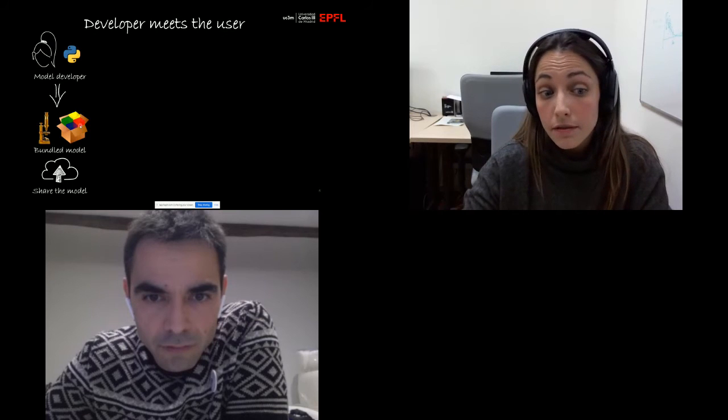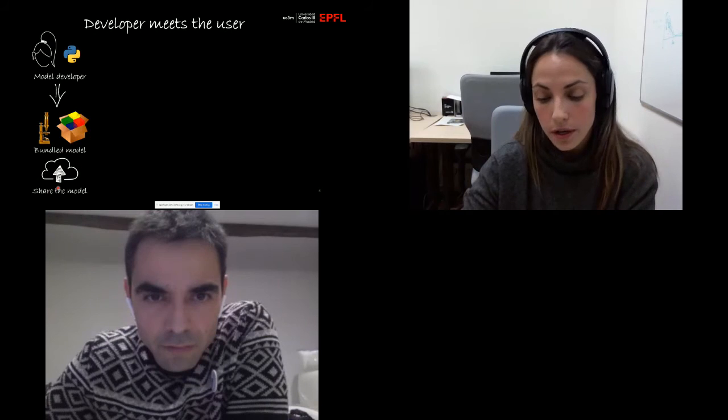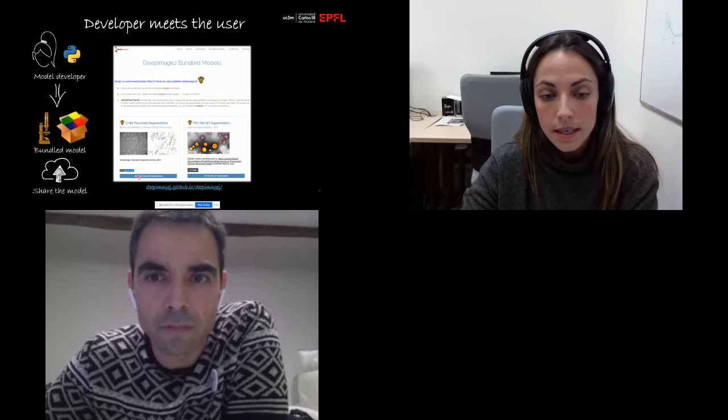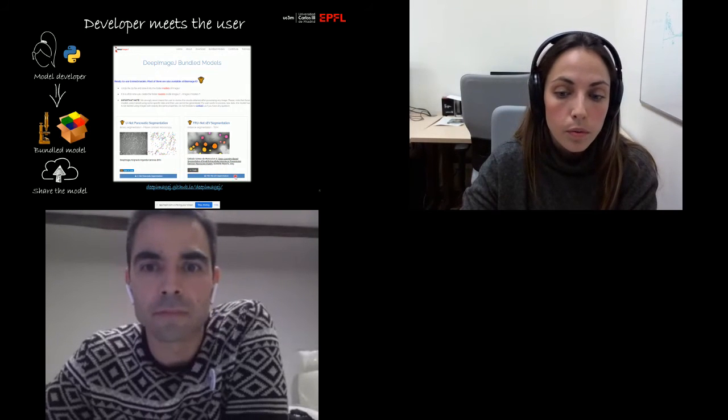So how does it work? We have a model developer who trains the model and creates a bundle model, just a file, as Romain showed to you. And this model can be shared in the cloud. So this is how the model repository looks like in our web page. We have the models, you just need to click on download. Some of them provide Jupyter notebooks, so you can train them, or the code, so you can reproduce it.